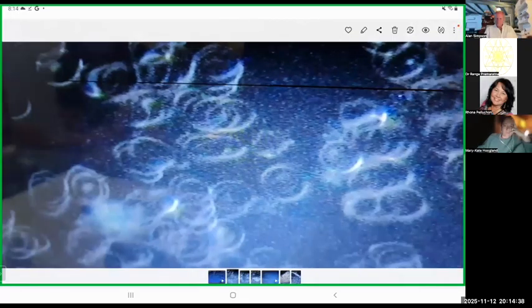This is another one. It's not so clear, but in this, again, you can see the stacking of the coins, of the red cells. That puts a lot of pressure on the heart to pump this blood. And when it passes through, that can cause stress on the arteries and the capillaries.